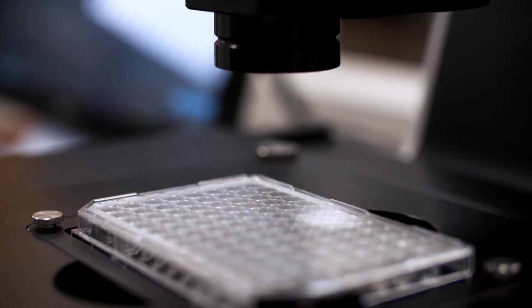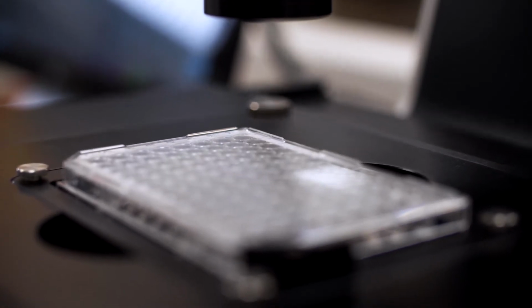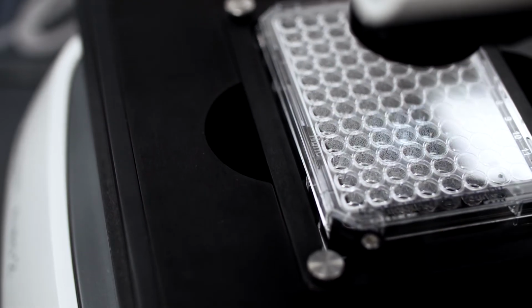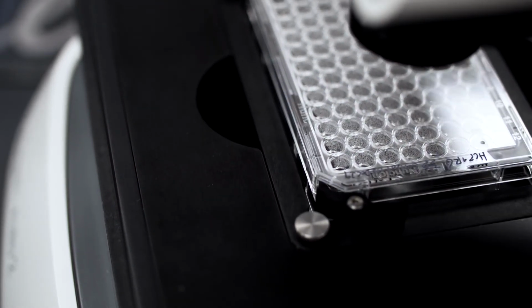That was the best thing, because when you're culturing cells, you're just going by morphology, by what you know from studying and research papers, that this is what they're supposed to look like. But a true form of validation comes when, at the end of your 14-day or 22-day protocol, the actual cardiac cells beat with rhythm, and that confirms that the cells you have are cardiomyocytes. It's easier to visualize on this because you don't disturb the wells too much, and any disturbance would impact their beating or movement. With the imaging system, without disturbing them, you can visualize their rhythmic movement.